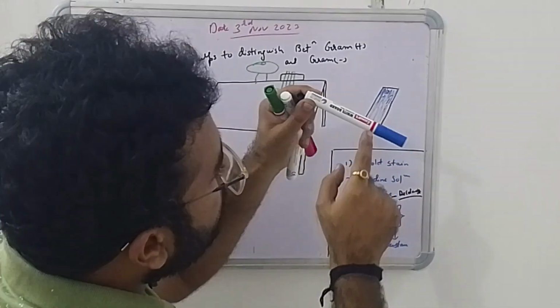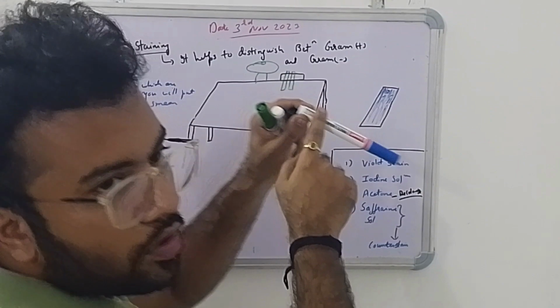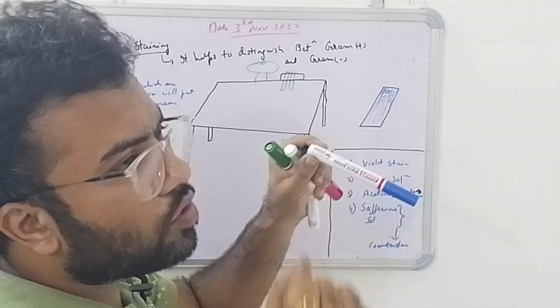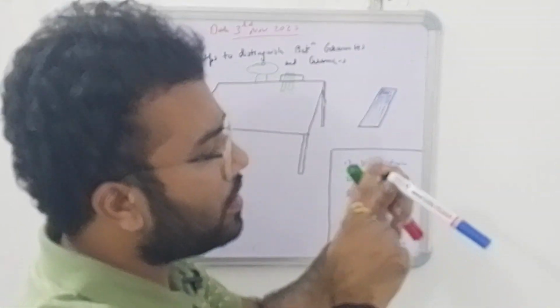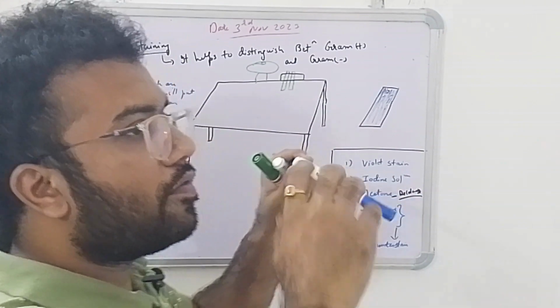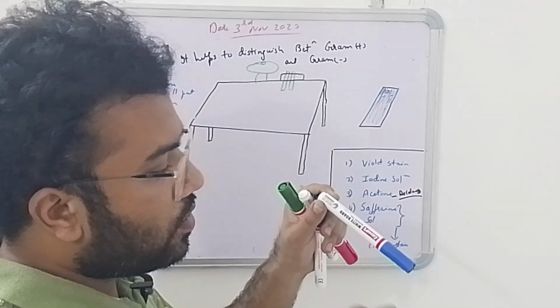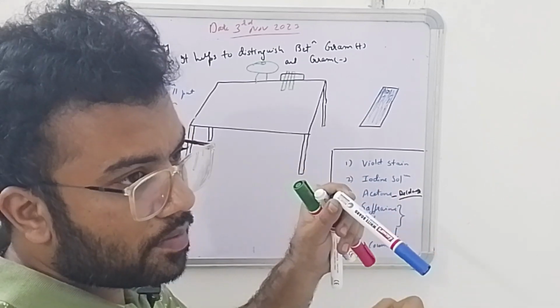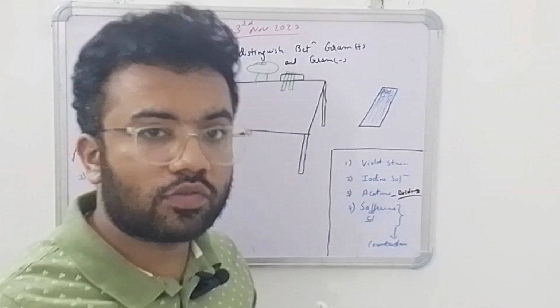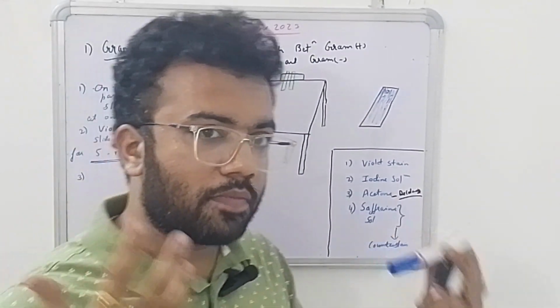The smear is at one end, so don't grasp with the forceps where the smear is present. Use the side where the smear is not present, so you will not damage the smear and can visualize it better.